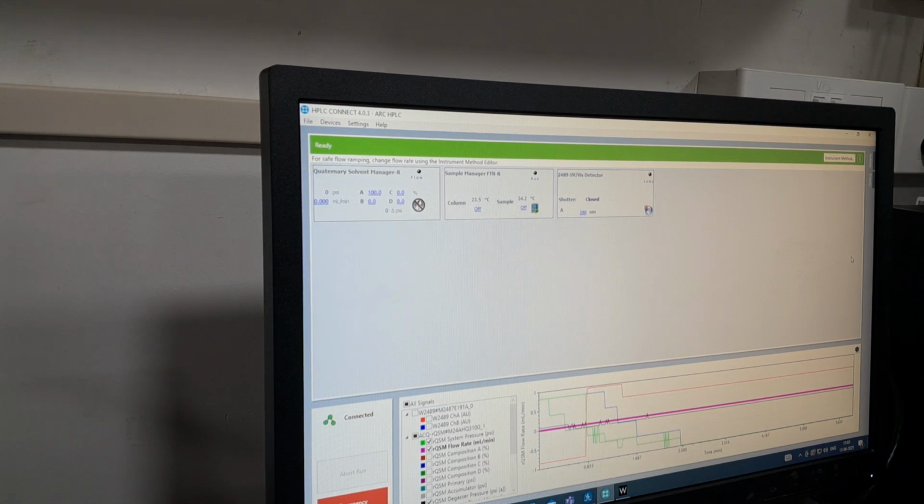In the Central Store, actually no one orders HPLC ethanol. Ethanol is a bit costly compared to HPLC grade methanol and acetonitrile, which are very common and easy. It will be more costly, so we'll be getting it in some mLs. In future we will order it.